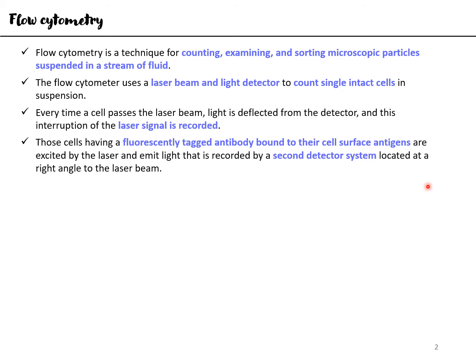Why? Because under such placement conditions, how do I put it? So the laser beam is obviously moving in a straight direction, but some waves of light will deflect or will not really be moving in a straight line, like directly from the laser to the detector. Okay, wait, this will make it clearer.